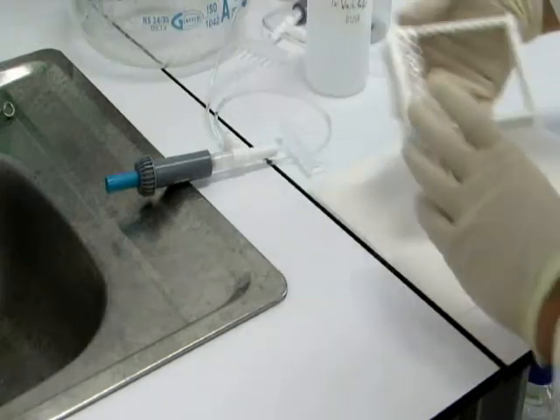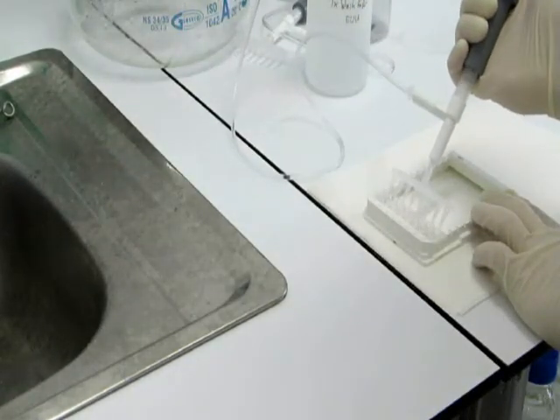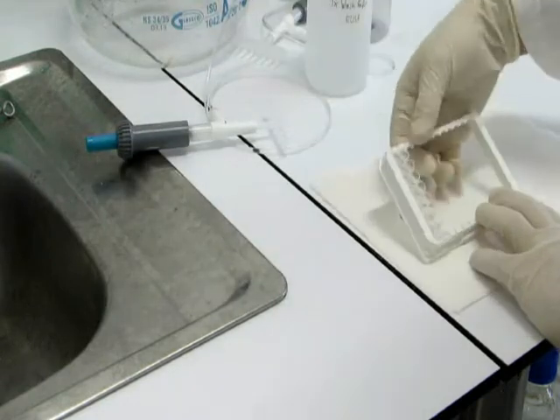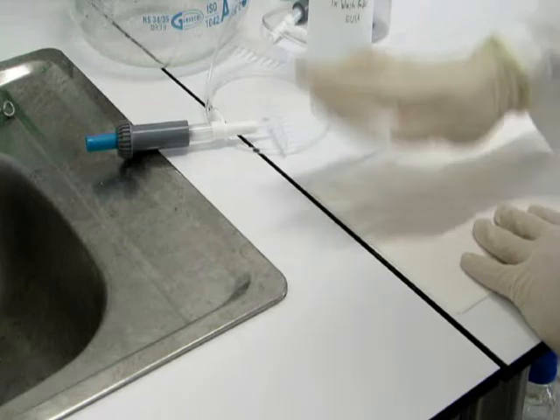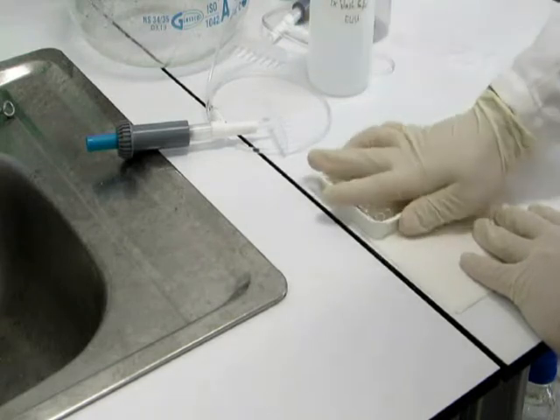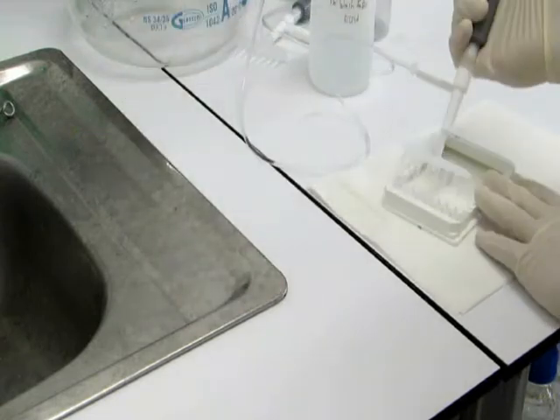Discard the solution inside the wells and add 200 microliters of wash buffer into each well. Completely empty the wells by tapping the microplates upside down on paper towel. Don't be afraid to use force. Repeat the procedure 4 times for a total of 5 washes.